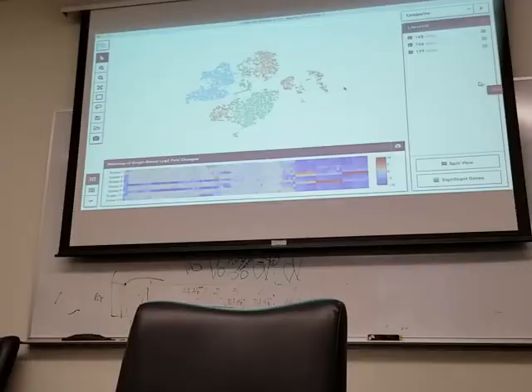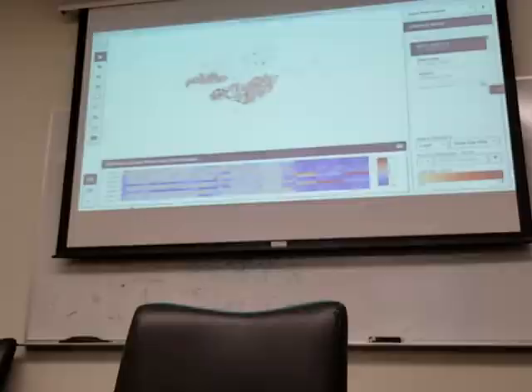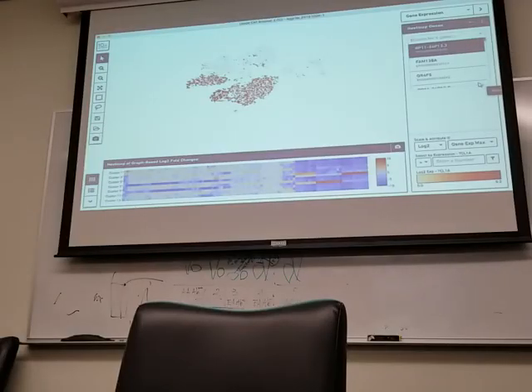That's really what I'm after, and I don't care what the difference is, if it's heavy or light chain V. So what are the signature genes that define it? Can we just look at those now? I think ISG 15, ISG 20. ISG 15. Yeah, there are a few, and MX1, those are the classical type I interferon signature ones. Right, what am I looking for?